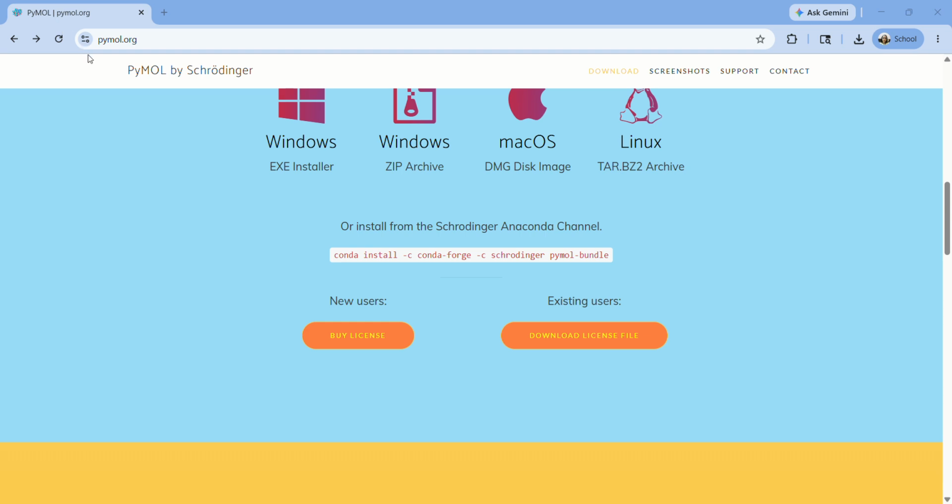After that, there are also residues. We know proteins are composed of amino acids. Now you can see all the amino acids in the software. We can easily teach amino acids with the help of this. Alanine, asparagine, arginine, cysteine, glutamine. Students can simply learn about this.